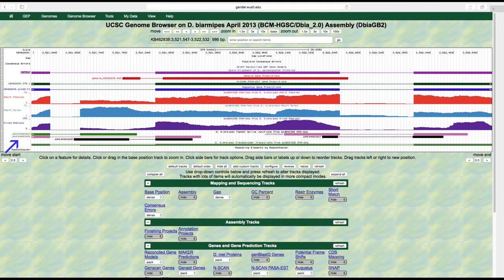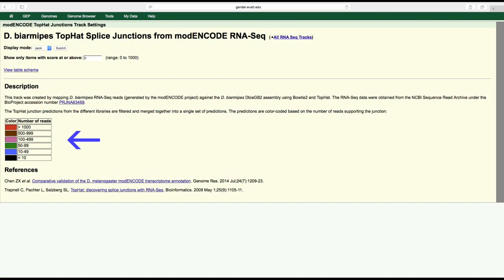The predictions are color-coded to indicate the number of spliced RNA reads that support the predicted splice junction. Red indicates that there are more than 1,000 spliced RNA-Seq reads supporting the junction, followed by brown, pink, green, blue, and black in descending order, with black corresponding to fewer than 10 reads.